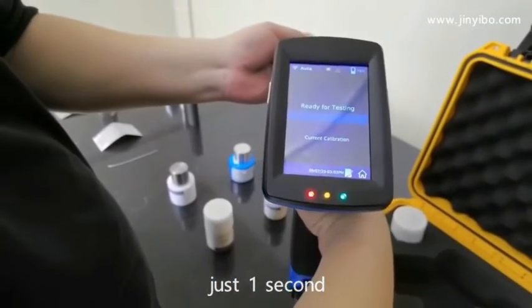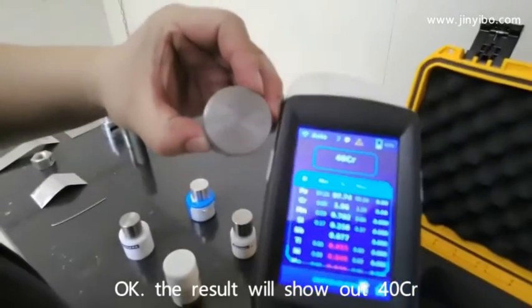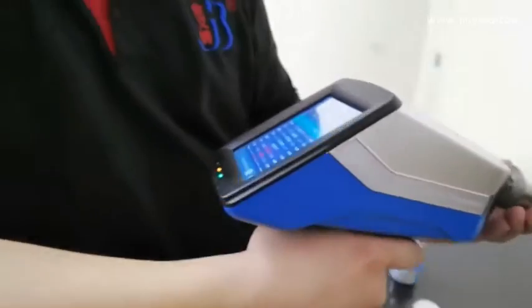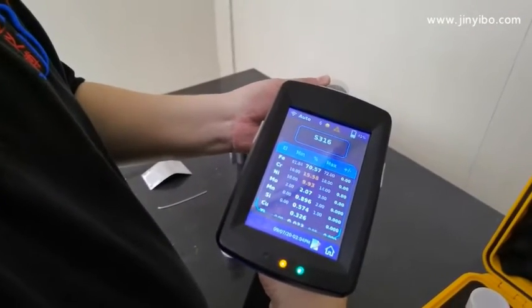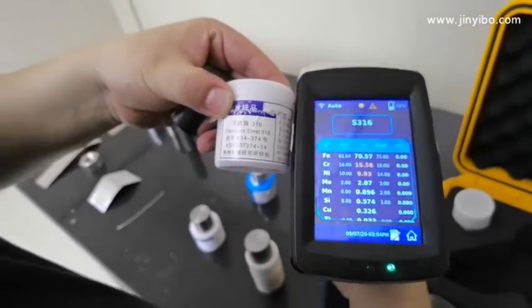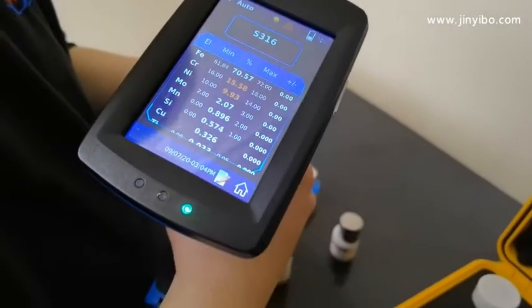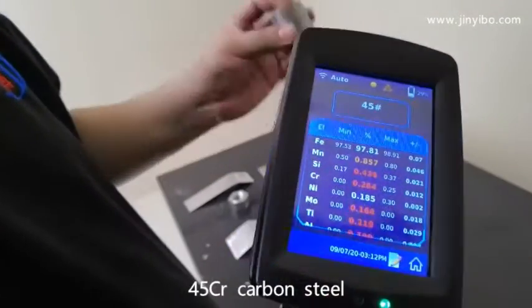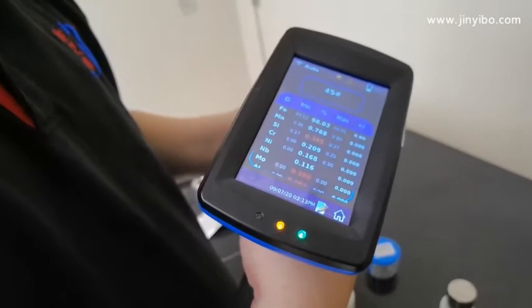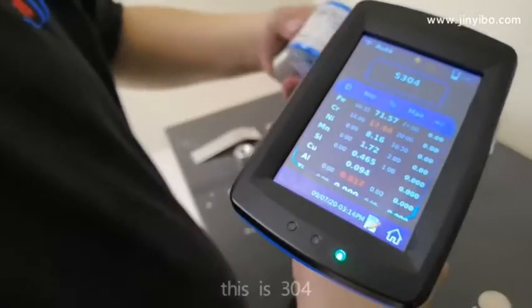Just one second. The results show out — this is 40 chrome. This is 316. Okay. This is another sample — 45 carbon, 45 carbon steel. This is 304.